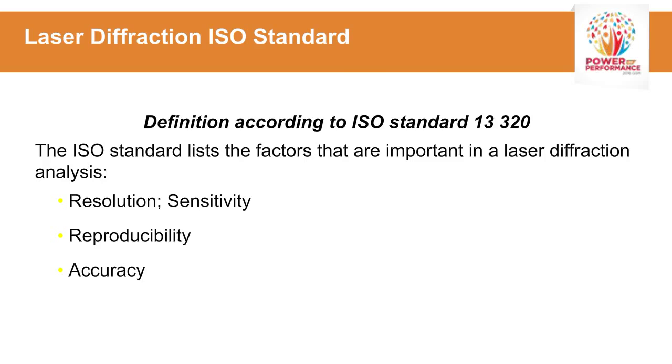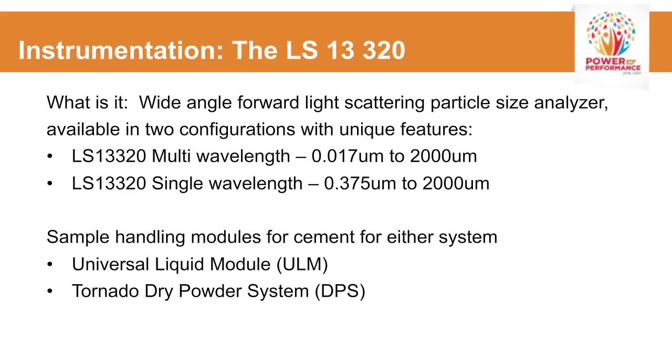In other words, you want to be able to resolve different sizes easily and also be able to sense small changes in a particle system. If the distribution is changing, be able to see these readily. Reproducibility, of course, is very important. And then accuracy of the results. We'll discuss these in more detail later in the lecture.